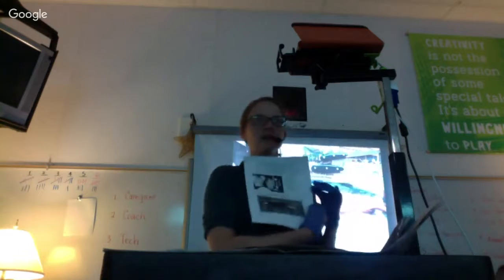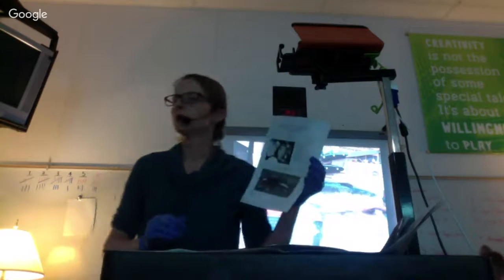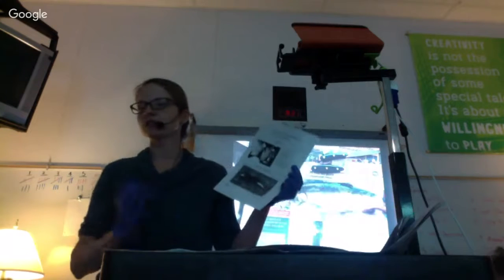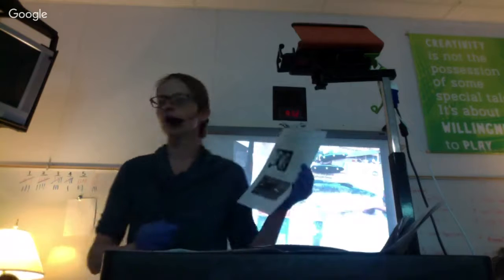So what we're going to do right now is we have all the parts. There are some parts that we chose not to get, like we didn't need ice cream buckets. But as you can see from the sheets that I gave you, adults, we have all the materials. So what we're going to do right now is look at the external anatomy and identify the different parts of the salmon. For everyone on the table, let's see if you can identify the exact place of the nostrils, and I'd like you to go through as a group to identify all the other different parts.